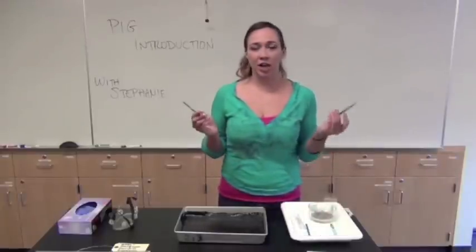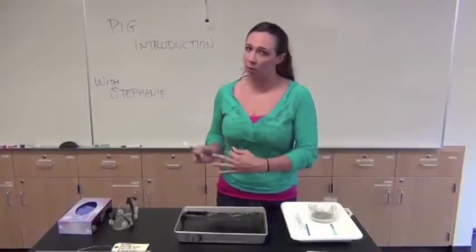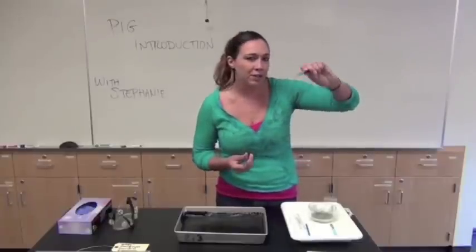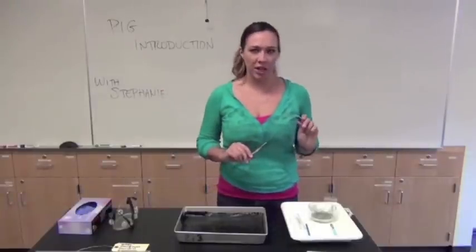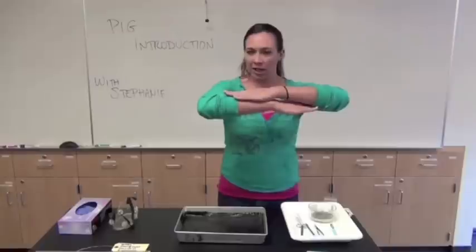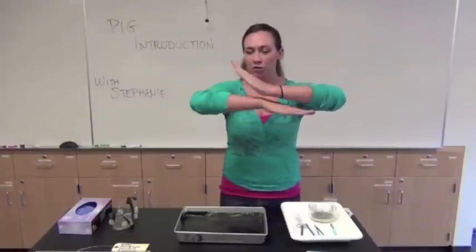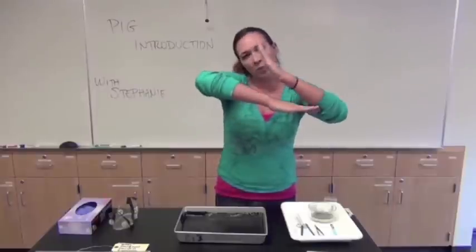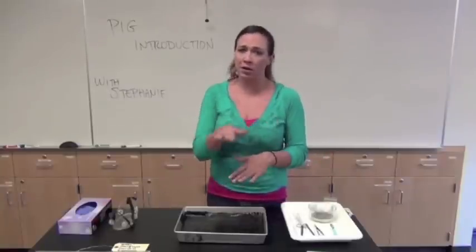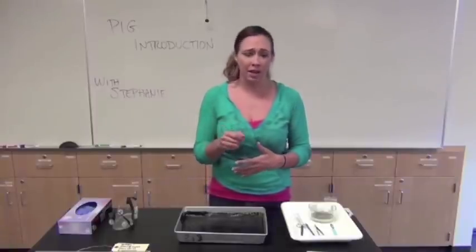Next up are the scissors and tweezers. One person should be doing the dissection at all times while the other takes notes and pictures. You always want to lift up with the tweezers and cut with the scissors to remove layer by layer, so you don't damage anything. Lift and cut right at the connective tissue, then lift again and cut, slowly peeling layer by layer. This helps you avoid damaging organs or the thin arteries and veins underneath.